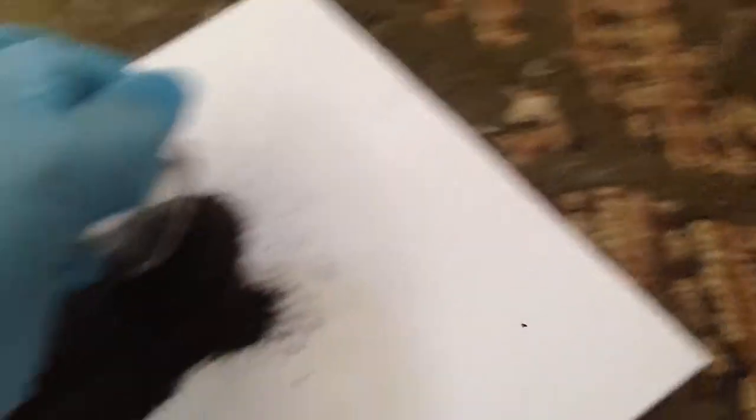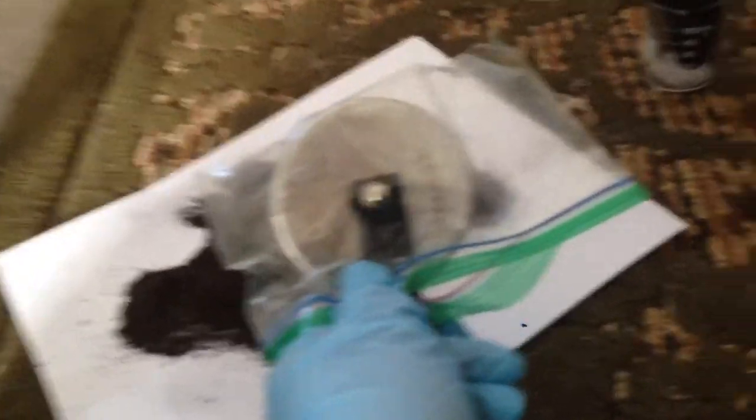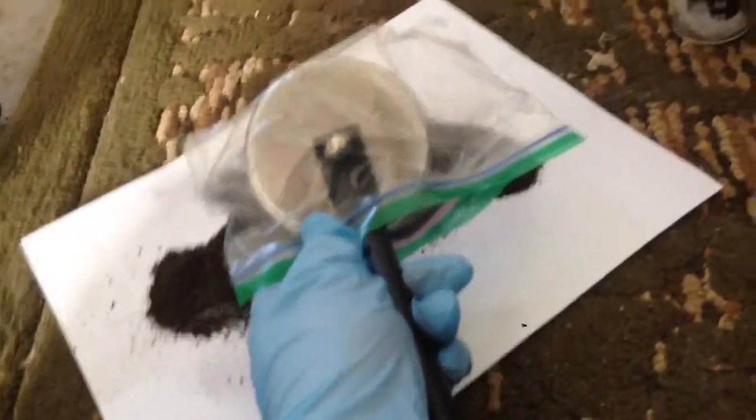I transferred it all back into the original beaker, then realized I shouldn't have done that and laid it back out on the paper, trying to spread it out the best I could. I then took a very strong neodymium magnet, put a plastic bag around it, and waved it over the material to catch any iron.